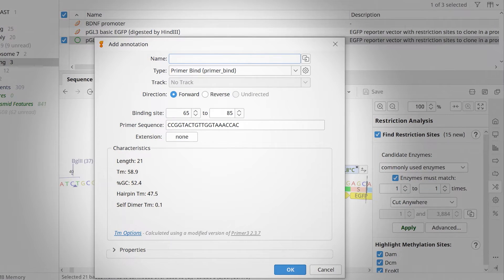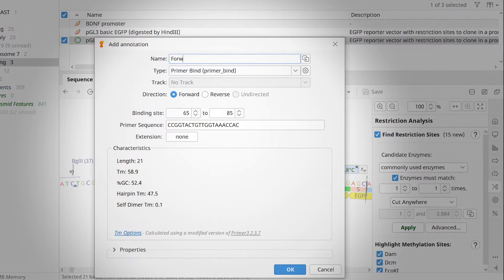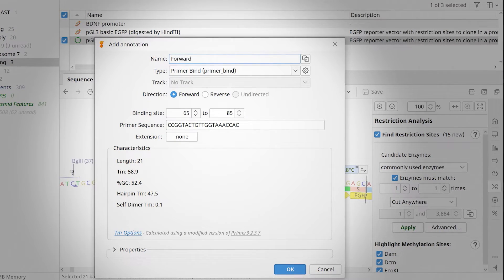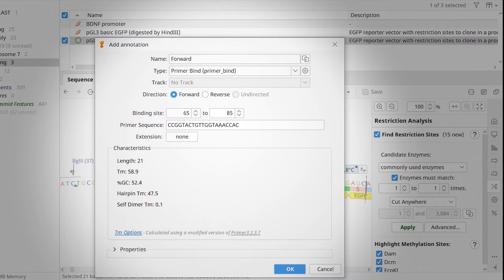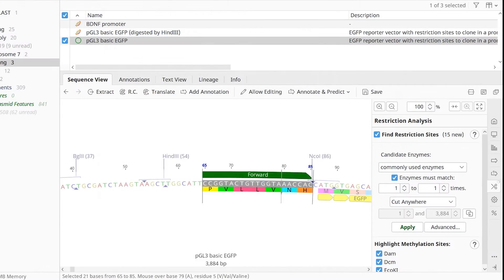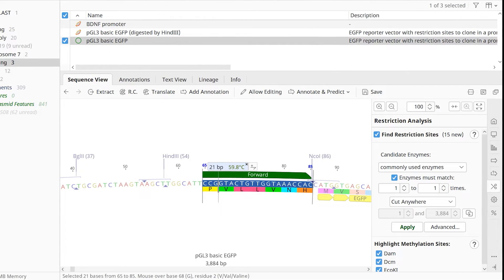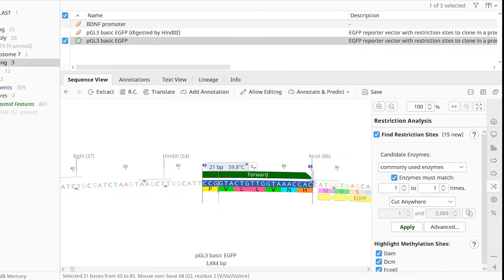In the new window, give the primer a name. Ensure the direction is set to forward and click OK. The Primer Bind annotation will now be visible on the sequence.